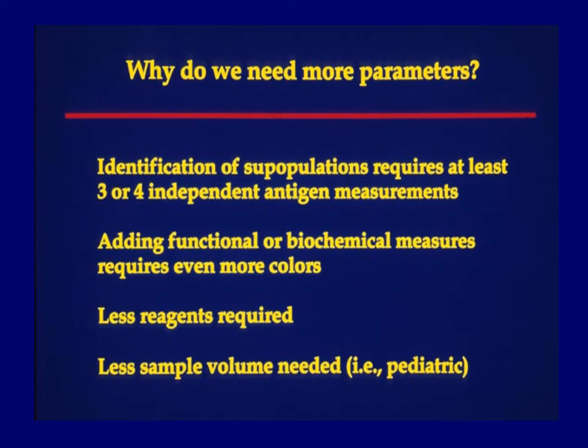We can study pediatric patients for some of the applications that we've had. For example, looking at CD11b as a marker for ruling out sepsis, something which we're not going to show a slide on at this time, but maybe we'll talk about it in one of the sessions if we have a chance.